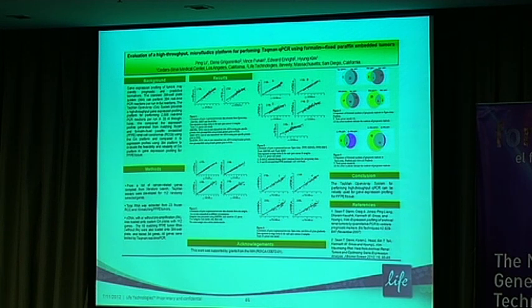To embark on this study, there were so many different comparisons that they did. They compared different reverse transcription methodologies. They used random priming, gene-specific priming, oligo-dT priming. They had us design special assays for the FFPE material, because as you know, FFPE samples are extremely degraded. If you use large amplicons, the amplification efficiency drops dramatically. So we designed very short amplicons for them.